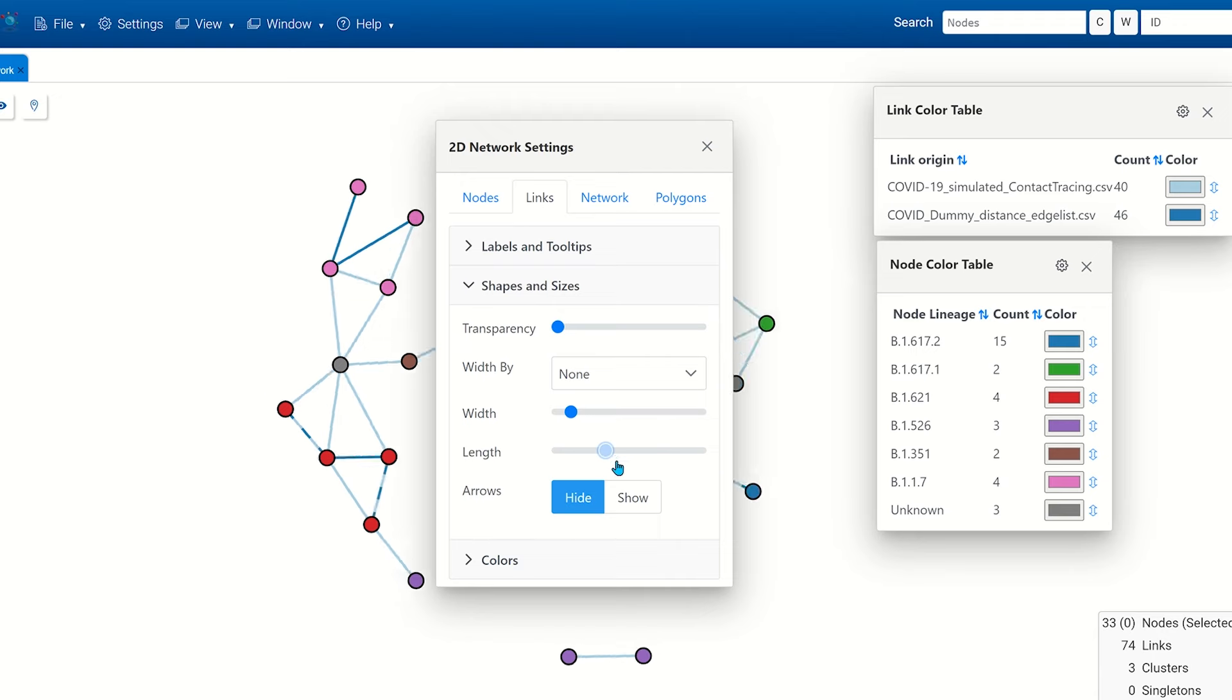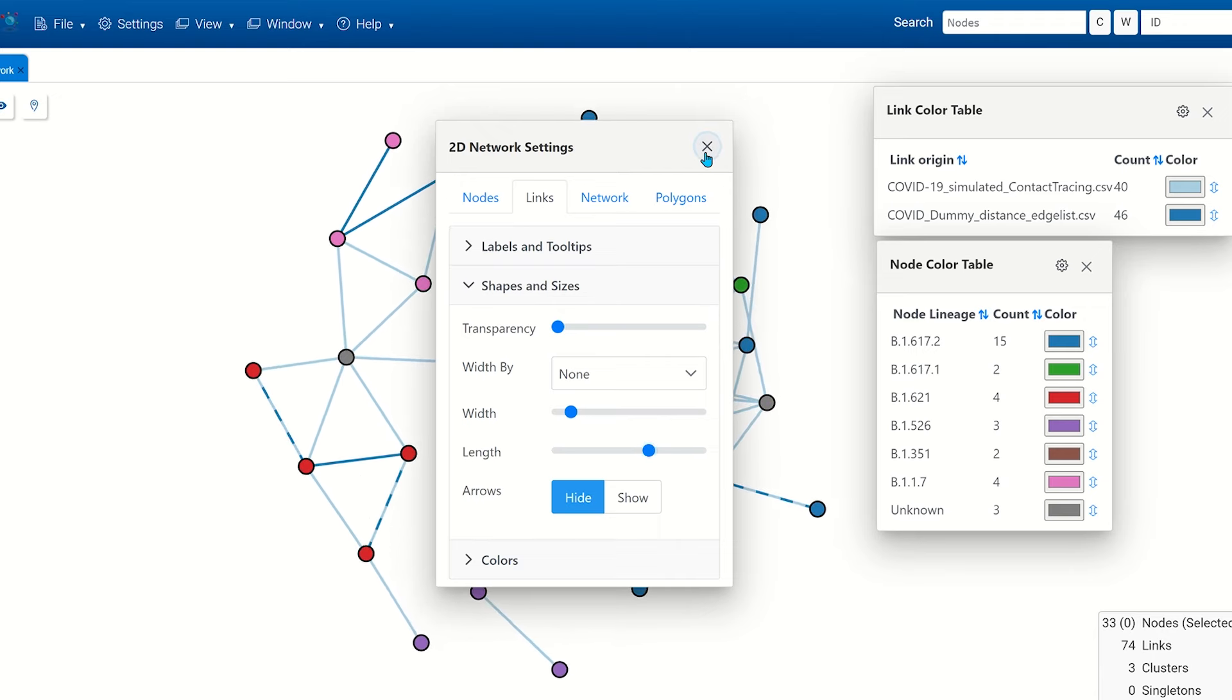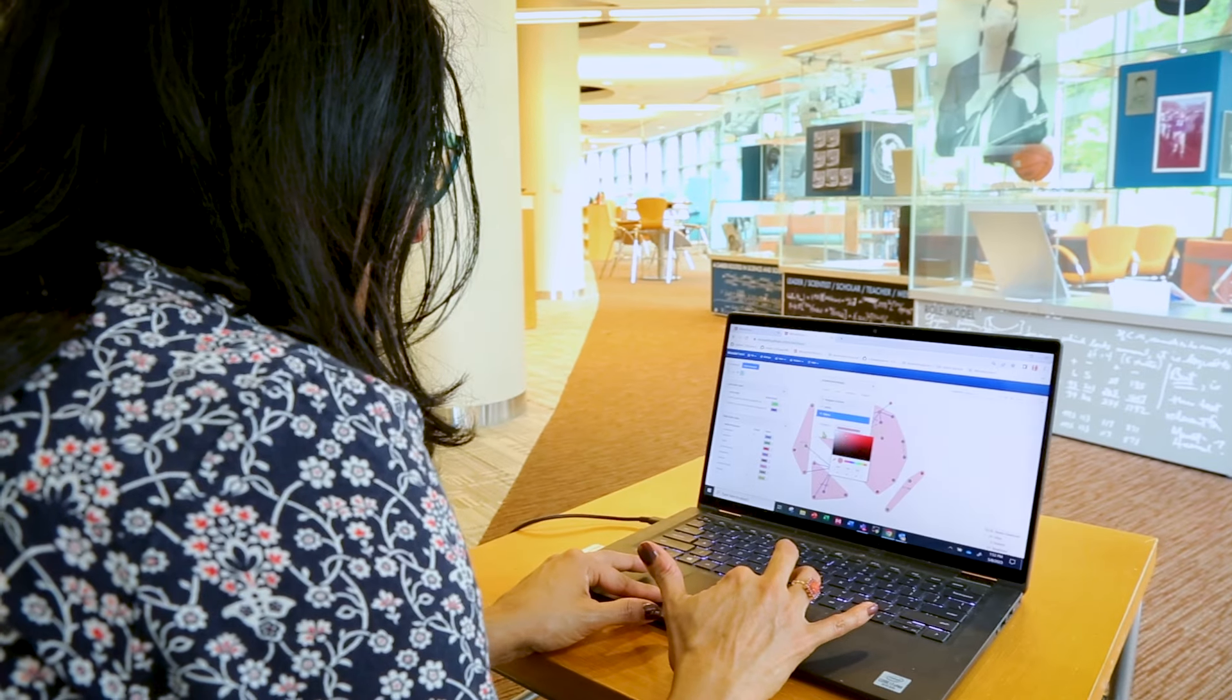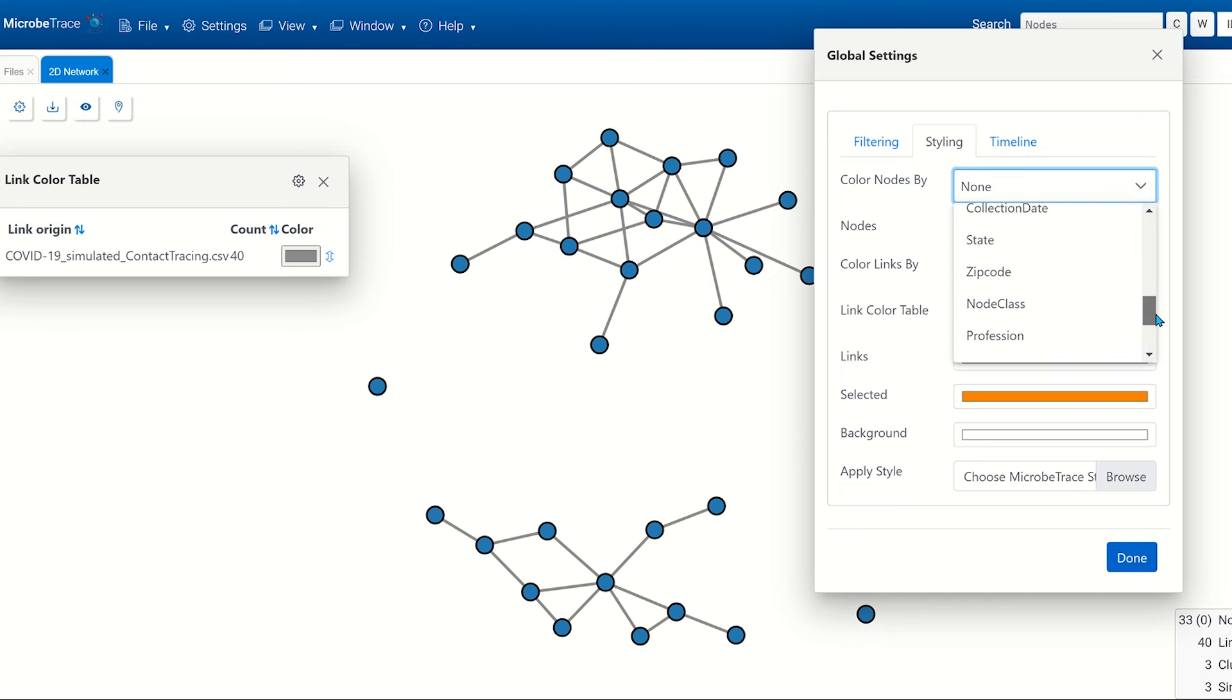MicrobeTrace runs locally on your computer and uses your web browser for visualizations. This means your data do not need to be uploaded onto a server for analysis.